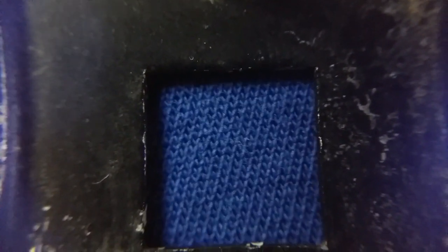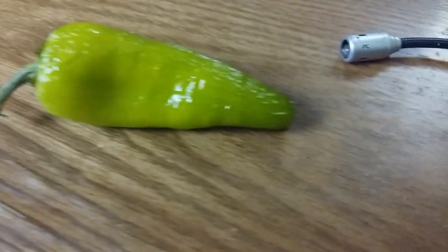Look, this is my t-shirt. Now it's your turn, you little weird yellow thing. Let's see it.